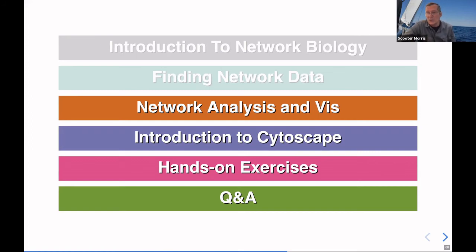If I have a list of genes, I need to use them as a background. Can I do that? Yeah, so what you'll do is use that full list of genes and create a network from that. That'll bring down all of the data for that entire list of genes. Then if you take a subset of that and want to use the whole gene list as your background, you just point to that network that you created.